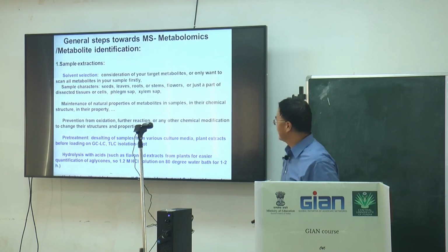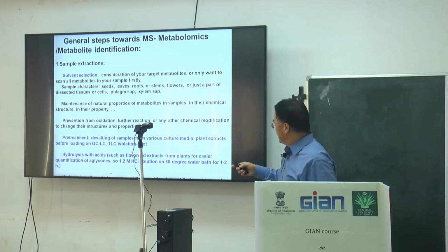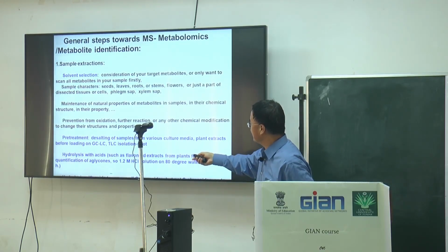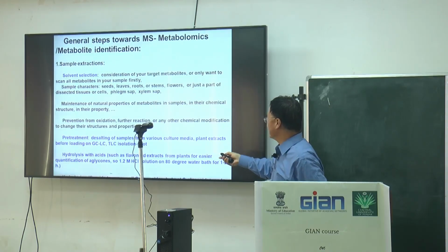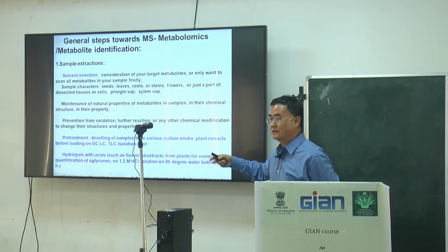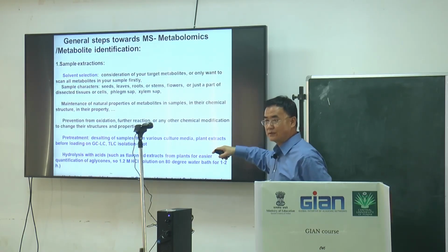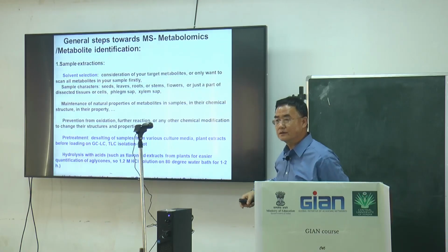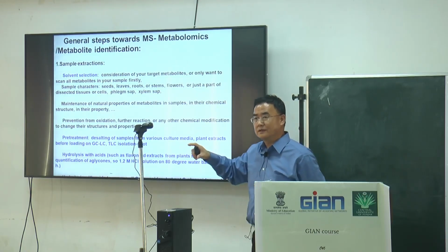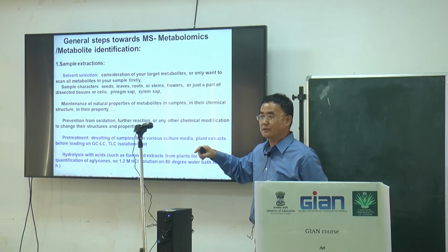Similar mechanism for metabolite extraction. Also pre-treatment: desalting the sample from various culture media, you have to desalt the culture liquid. What can we use for desalting? Yes, there are PD10 columns. We can use them, I think called PD10 columns.